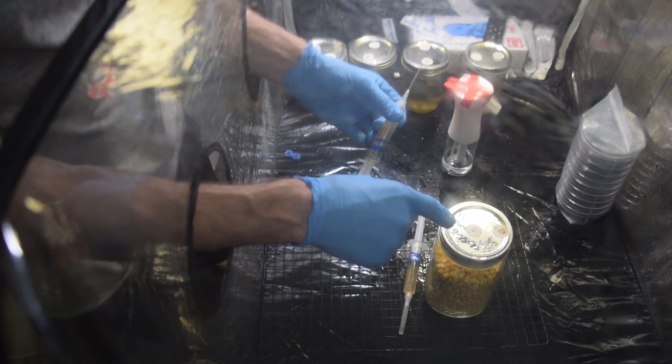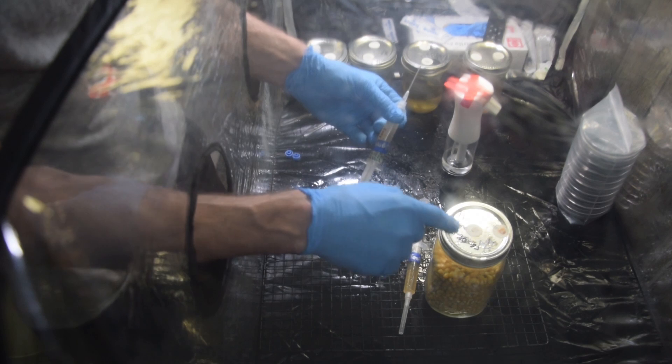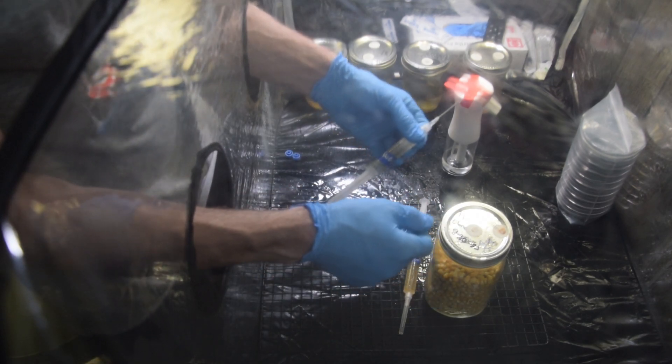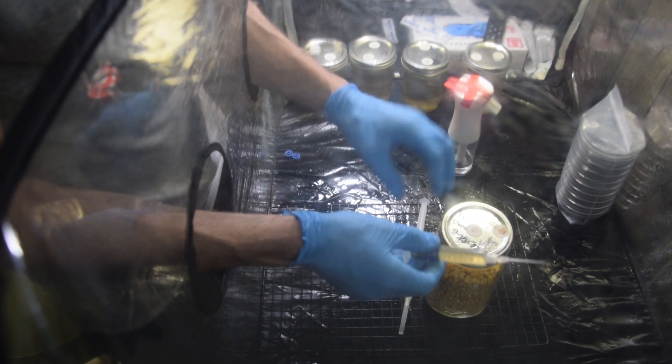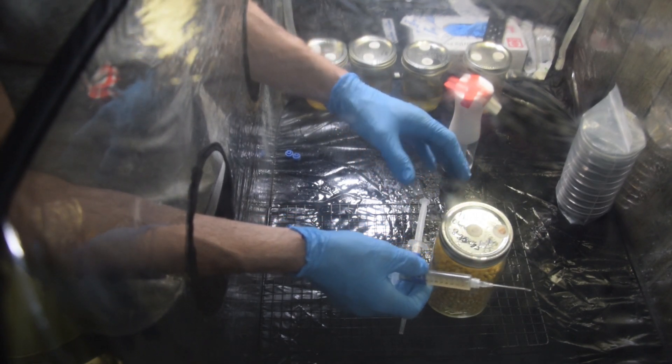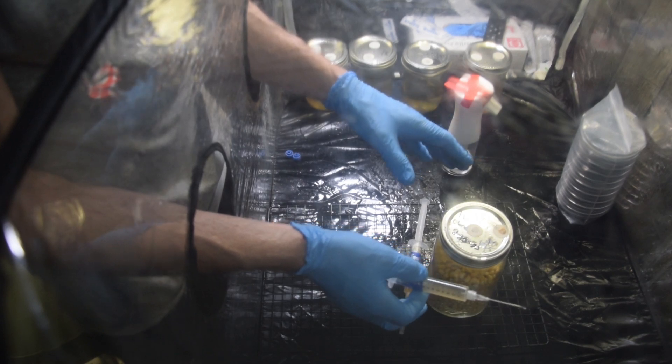I'm not going to be actually injecting through the airports here. I could, and then put a piece of micropore tape over top of it — I've done that before — but I'm not going to. Typically what I do is just slowly and gently remove the lid. You can see I'm working in my still air box here, and I've sterilized everything I've been working in here.